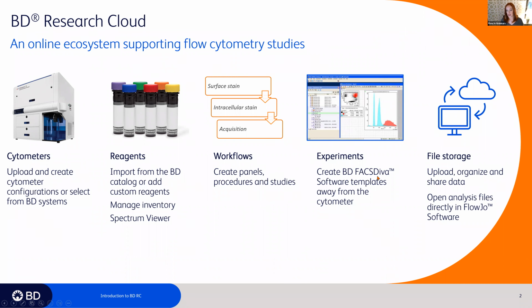Sometimes we're short on time at the cytometer and don't have time to label each of our tubes or each of our colors the way we want to. Wouldn't it be great if you could pre-label all of that before you got to the cytometer? So we've provided you with an opportunity to do that.